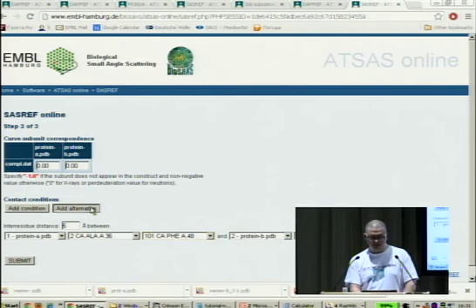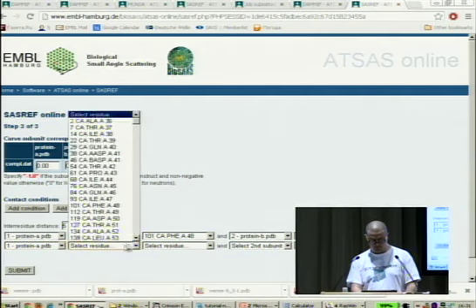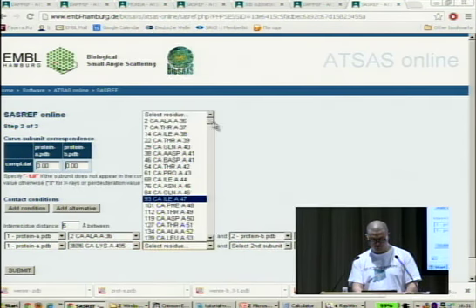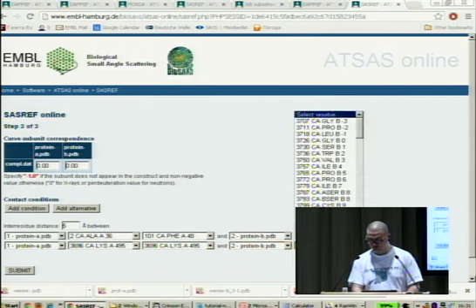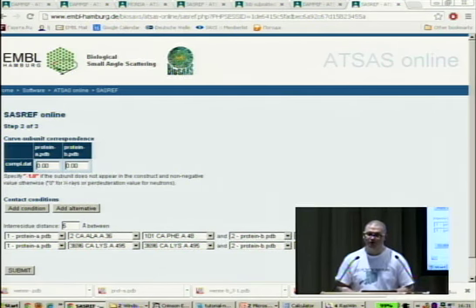Besides, you can add an alternative. So, for example, you can add either this or the last residue should be at this distance to whatever another residue. And then the program will use either one condition or another condition, because sometimes there is a certain ambiguity in this information and you need to add alternatives. Does that answer your question?